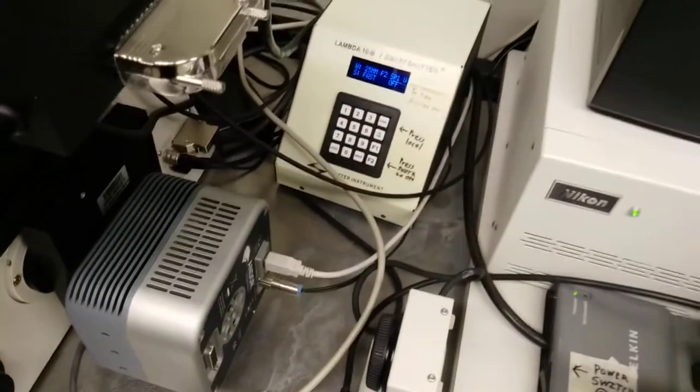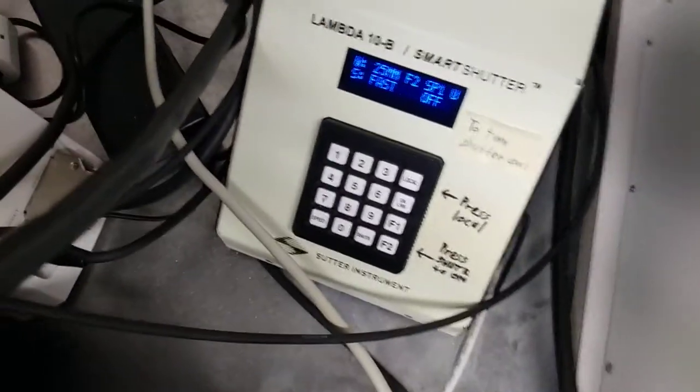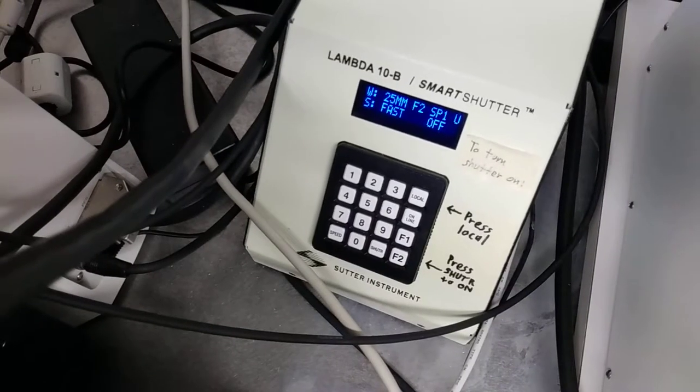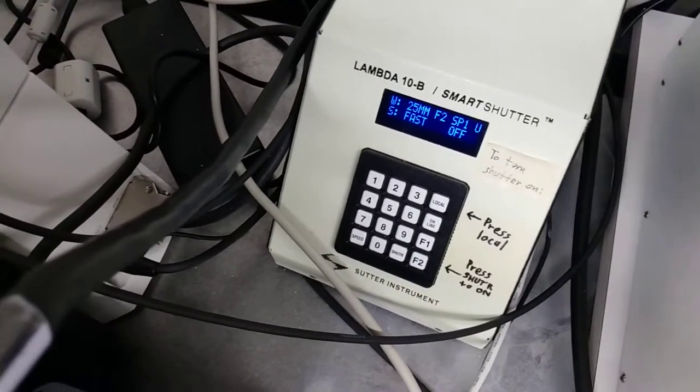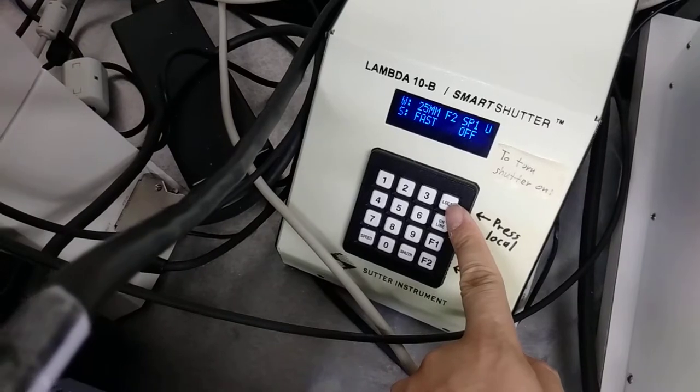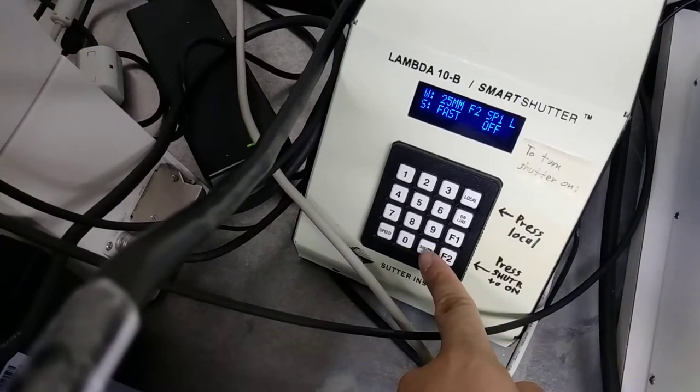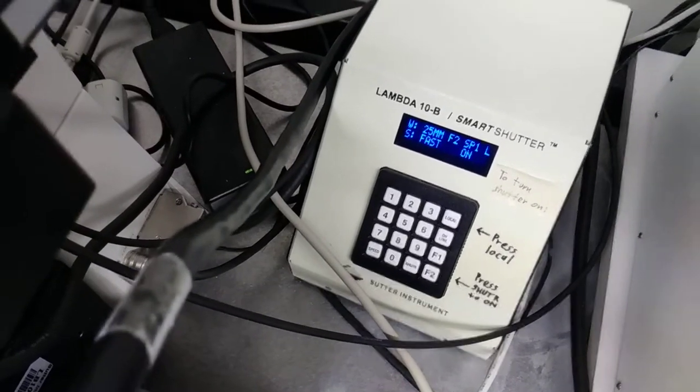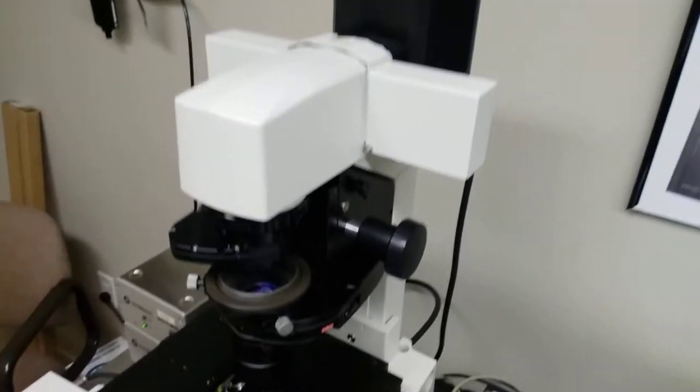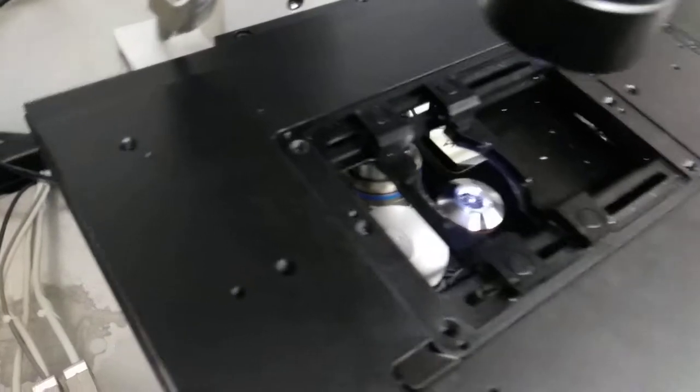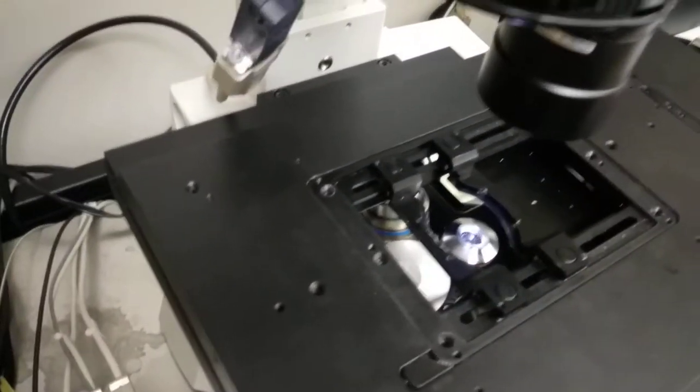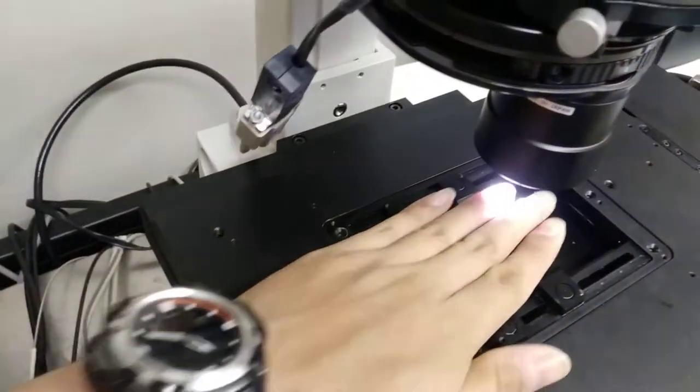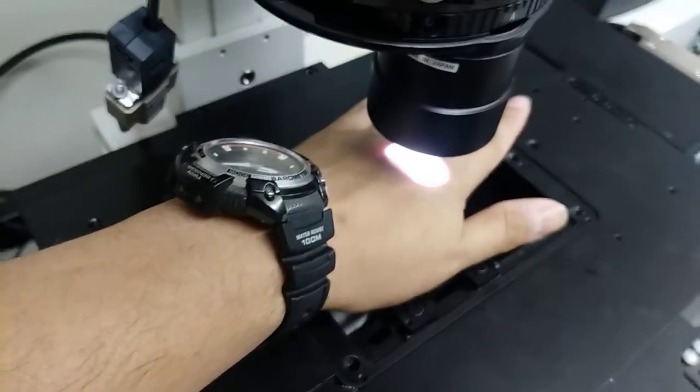We're going to go up here, go over to the Lambda Smart Shutter, which is right there. Really simple, all you have to do is turn on the shutter. To do that, press local here. And press shutter right here. What should happen is the shutter should click on. The lamp should turn on. And what you should see ideally is the light source on. You can see it by eye. If it's a little difficult to see, you can always put your hand under it. There's a bright light that shines and you're good.